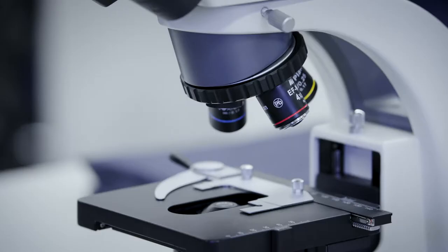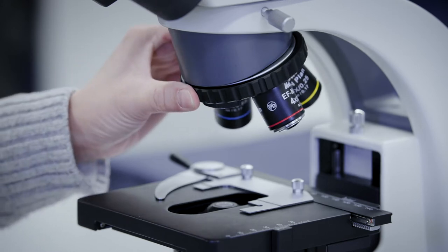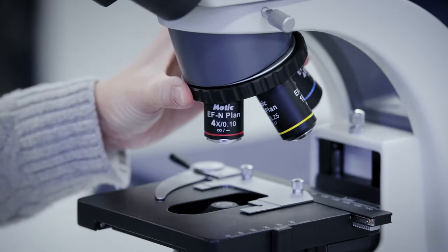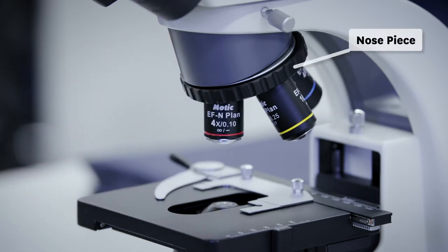Make sure the microscope is set to the lowest magnification using the four times objective. Rotate the nose piece if needed. Don't rotate by holding the objectives. The chosen objective is placed pointing downward towards the light source.